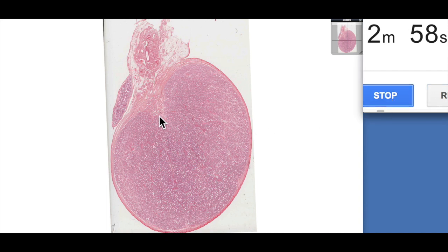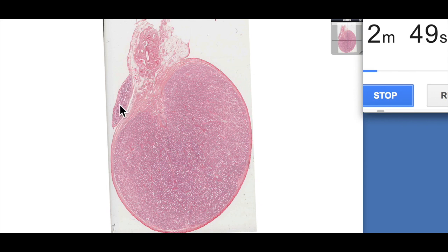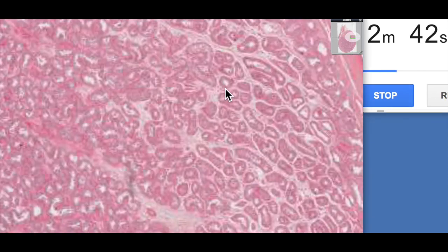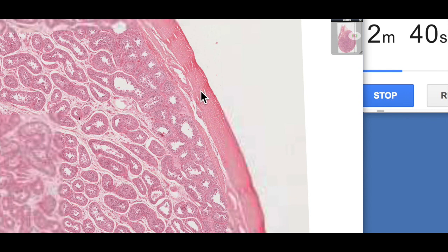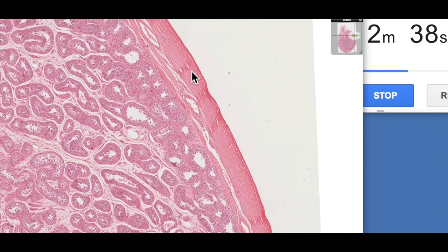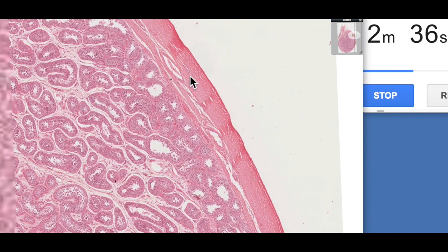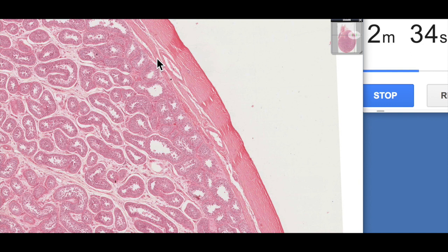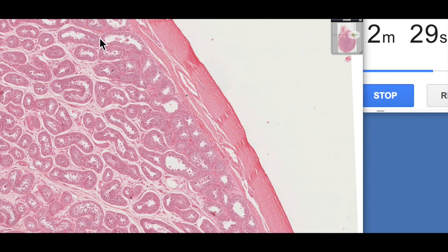Here we have the testis. It's oval in shape. This is the anterior surface, and this is the posterior surface. Here's the spermatic cord, and this is a glancing section through the epididymis, which sits on the posterior surface of the testis. We've got this thick, dense connective tissue coat on the outside — this is the tunica albuginea, this thick dense connective tissue capsule. And then beneath that we have the tunica vasculosa, which is where the blood supply to the testis actually arises.